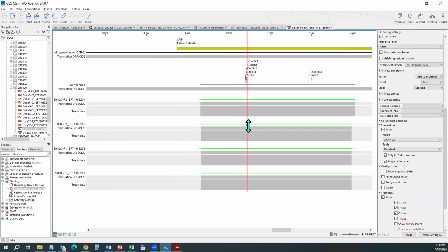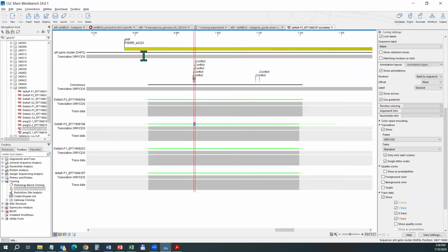Yeah, so this is sequencing of a PCR product with primers that are somewhere maybe here, and then sequencing with one of these two. So with base editing, you can actually really fast make such mutations because the cloning of the guide RNA is no work at all. And then the selection of mutants is also very quick and straightforward because normally the efficiency is above 90%. So you basically don't need to sequence more than 1 or 2 clones. Okay.